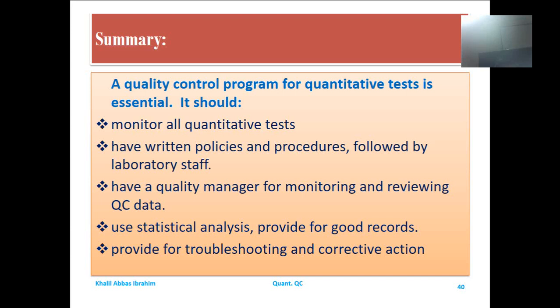There should be a quality manager in the laboratory with the system. There should be a quality manager responsible for monitoring, reviewing and assessing QC data.